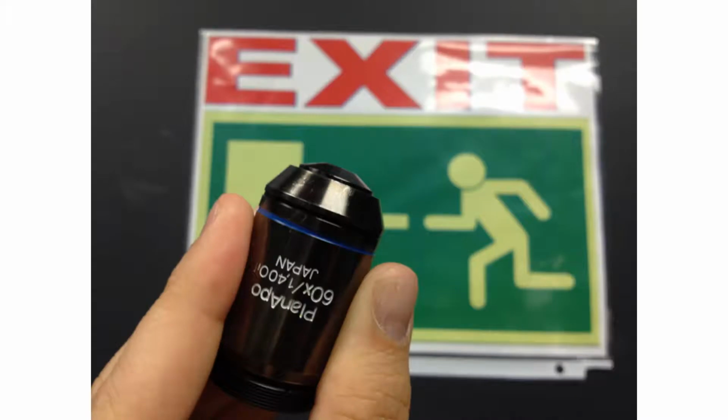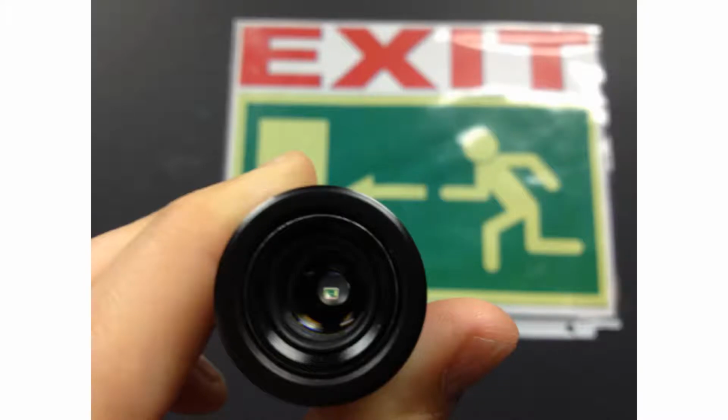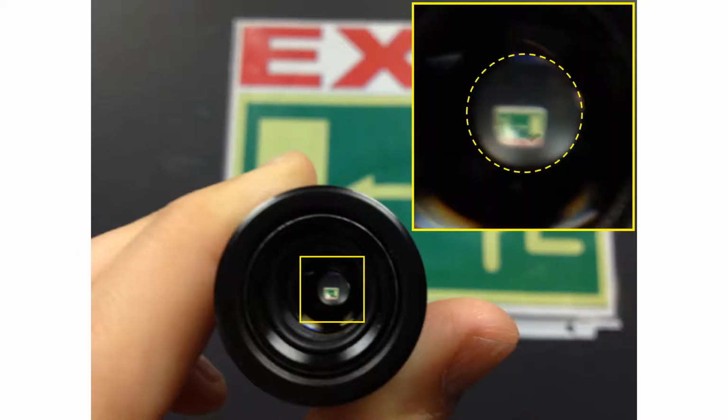Before continuing with this ray tracing exercise, I want to remind everyone objective lenses not only have an associated front focal plane at the top of the objective, but also an associated back focal plane at or near the bottom of the objective lens. You can prove this fact for yourself by holding up an objective lens to a faraway target object and viewing that object through the back end of the objective lens. When you do this, you'll see a small, demagnified, and inverted image of the target somewhere inside or close to the back aperture of the objective lens. What you're looking at is the objective lens back focal plane under this condition.